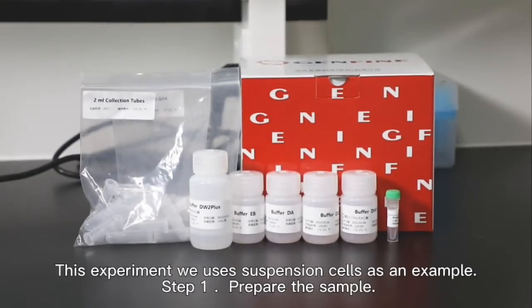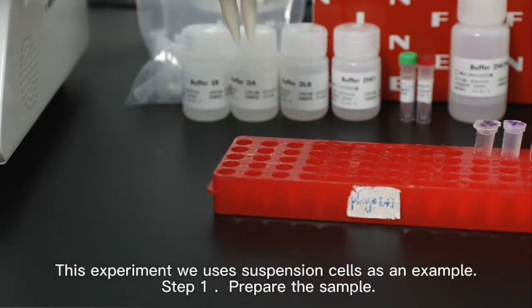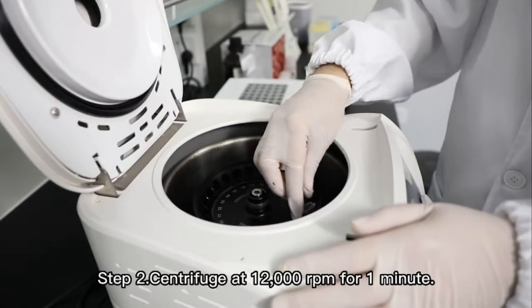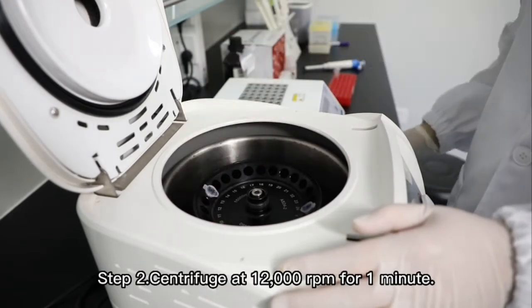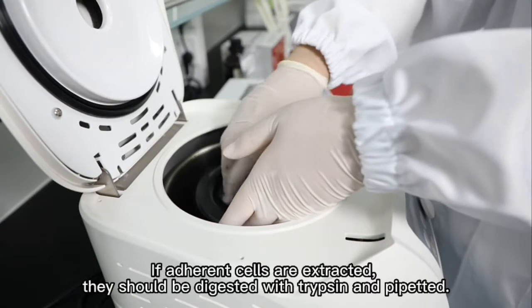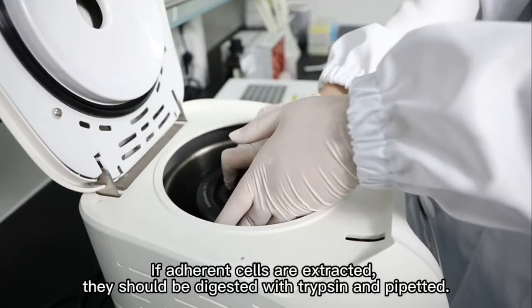In this experiment, we use suspension cells as an example. Step 1. Prepare the sample. Step 2. Centrifuge at 12,000 rpm for 1 minute. If adherent cells are extracted, they should be digested with trypsin and pipetted.